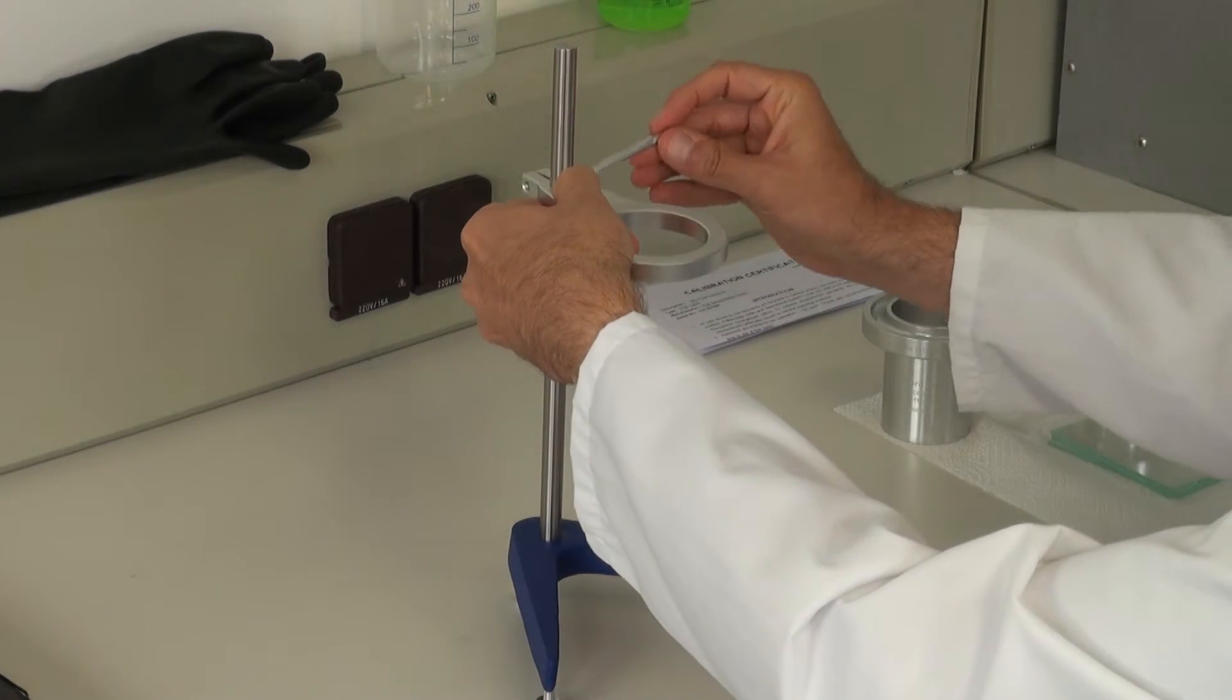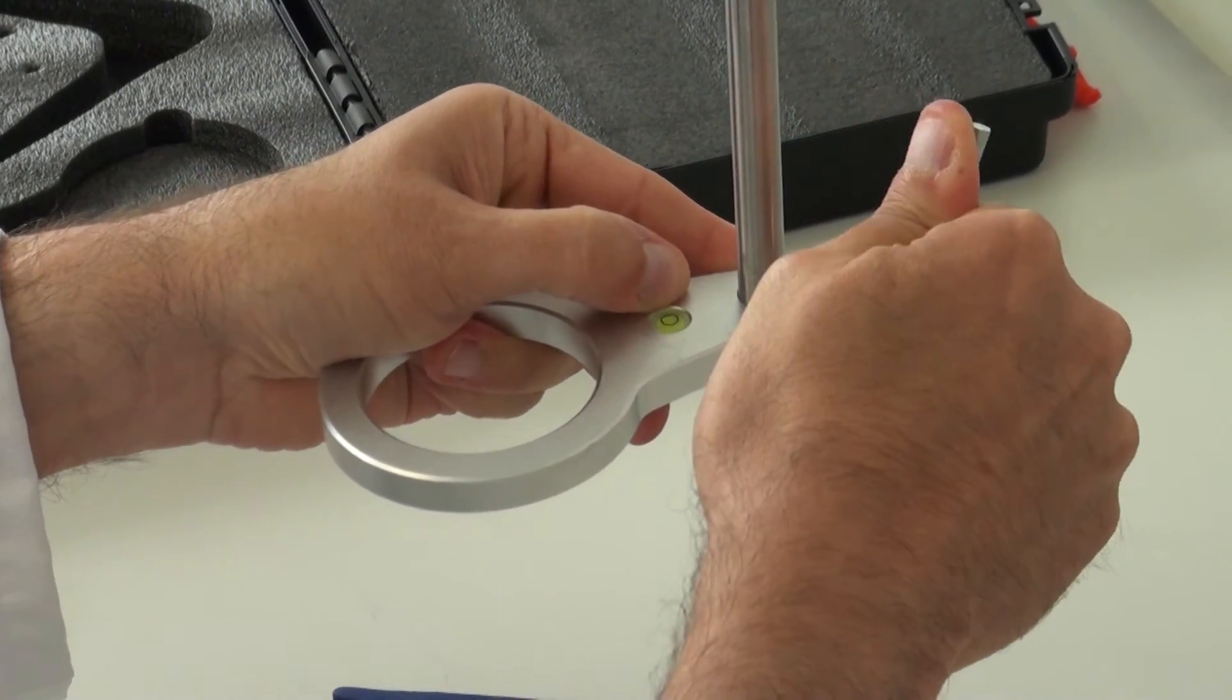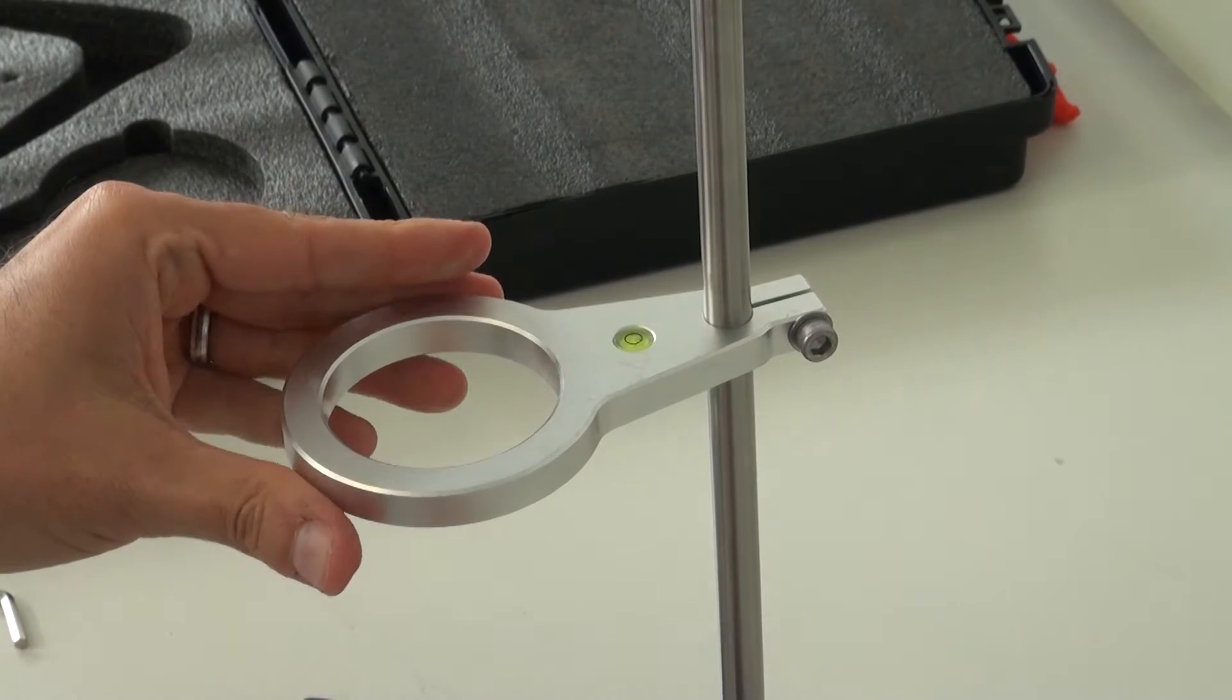Now we place the cup holder and fix it at the right height and tighten it using the allen key.